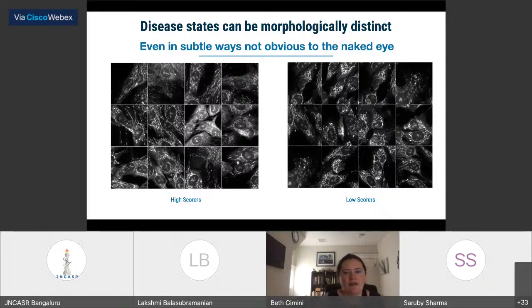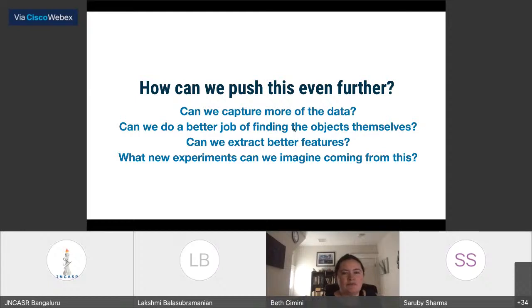So in the last 10-ish minutes, I'm going to tell you a little bit more about how, now that we know that profiling works and can be used for some really cool ideas, how can we push it further? What else can we do with it?